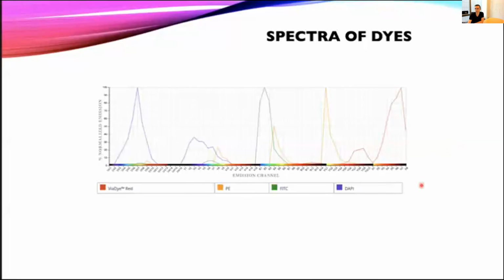Exactly. So basically, we want to reduce the amount of false positives in our analysis, right? Absolutely. Thank you.